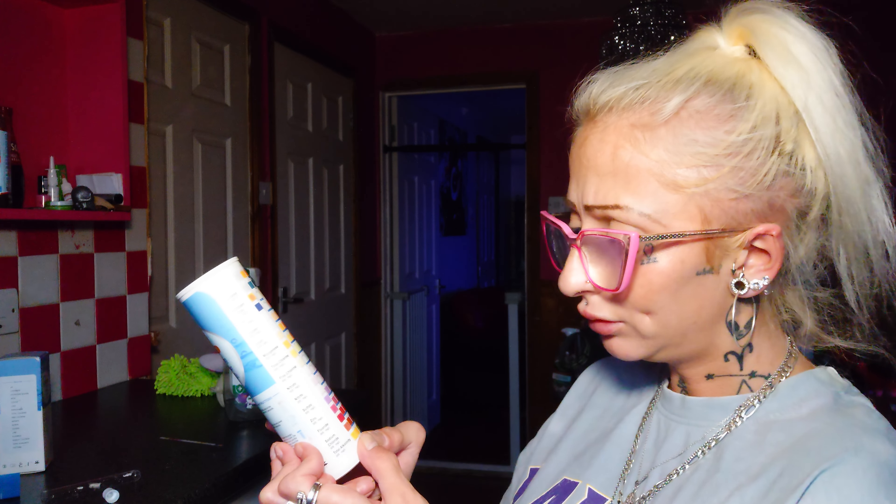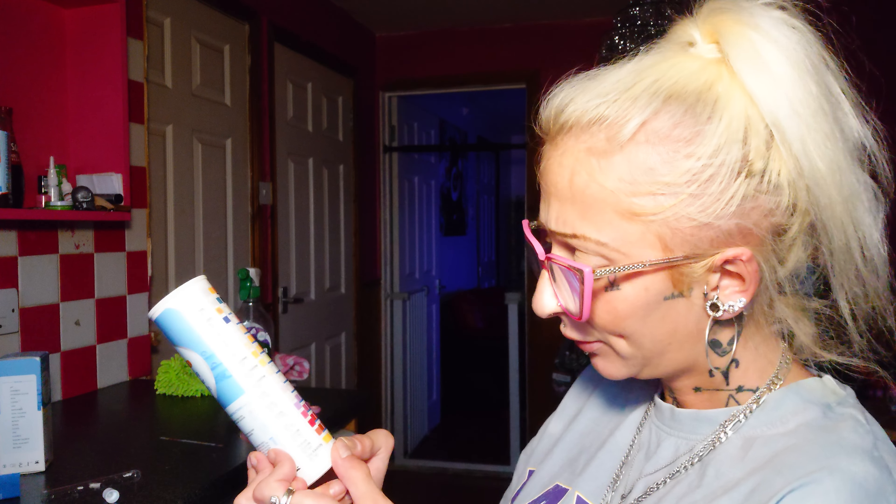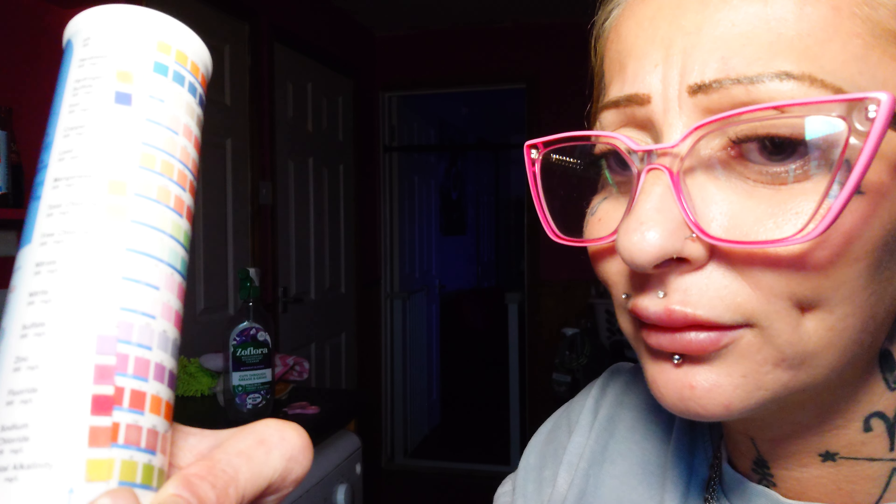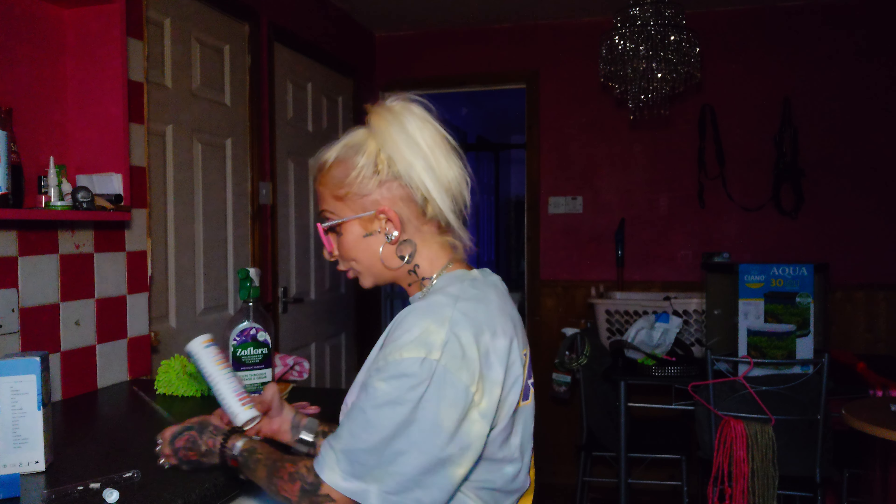The total alkalinity doesn't have an okay symbol beside it, so I'm not sure what that means. It's yellow. Right, that's cold water down.